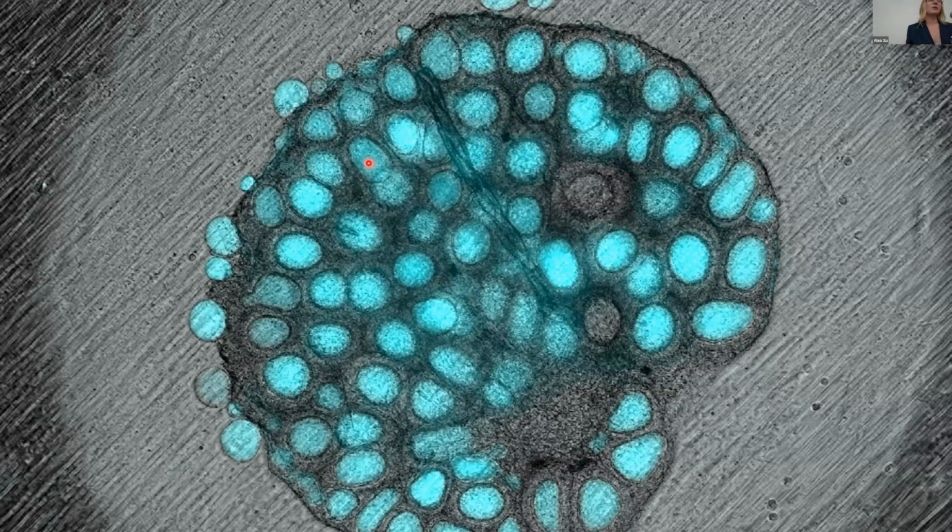So the induced pluripotent stem cells have a reporter, which is a cyan fluorescent protein. And this is driven by specific regulatory elements that are expressed only in oocytes, and in particular, this signal gets brighter and brighter as the oocytes grow. So these oocytes are iPS cell derived within this model organ of the ovary, and the somatic compartments are derived from embryonic progenitor cells in a single cell suspension that we combine together, leading to the self-assembly and creation of this model of the organ over 3 weeks.